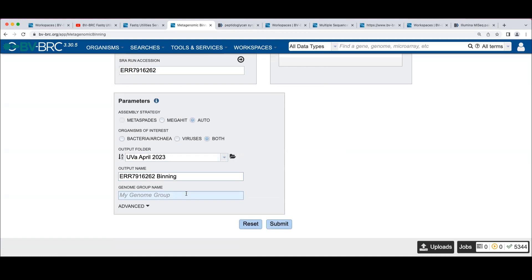In the binning job, you can give it a genome group name here so that all of the generated genomes from this job will be put in the genome group. So you can go back and easily find all the genomes that were associated with this run. Let's call this the binning group.